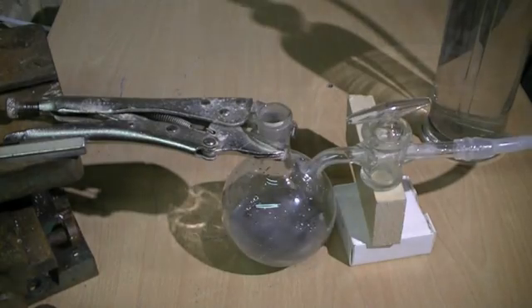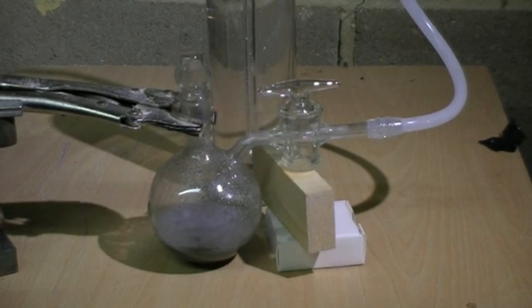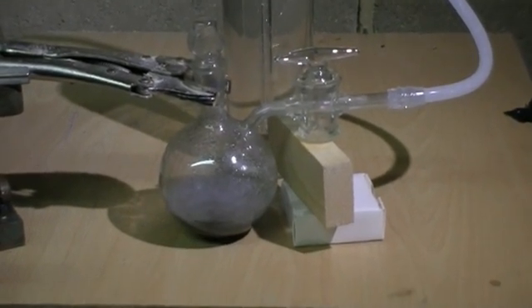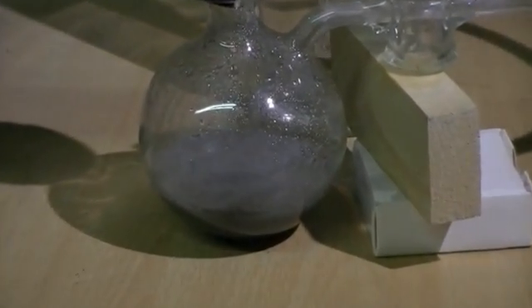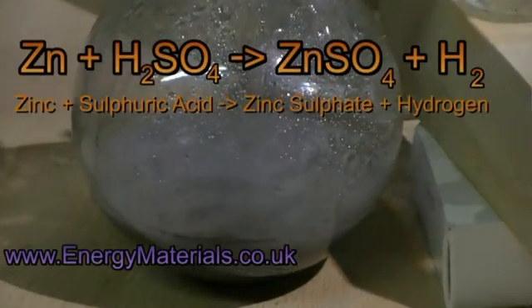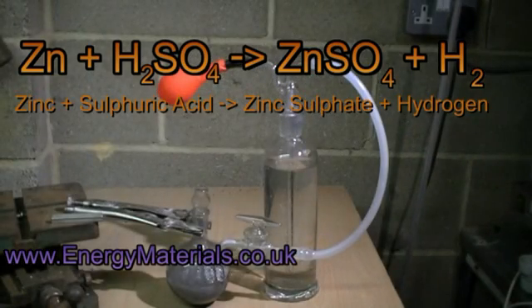Now with a bung fitted to our reaction vessel you can clearly see some gases being produced and it's bubbling from our bubbler. This gas of course is hydrogen. The chemical reaction taking place is that metallic zinc is reacting with sulfuric acid to form zinc sulfate and hydrogen gas.